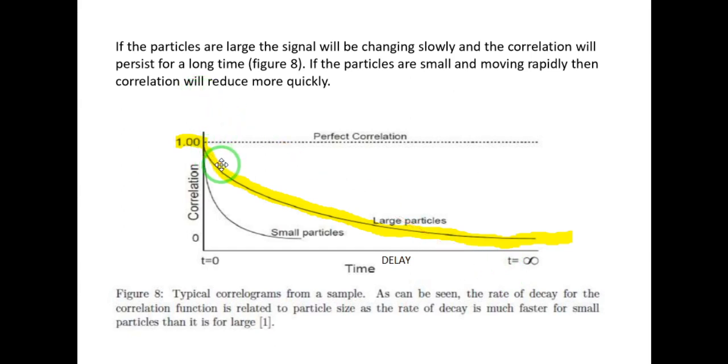So you see here that for large particles, the decay is getting longer compared to the small particles, and this is because the large particles maintain their memory longer compared to the small particles.